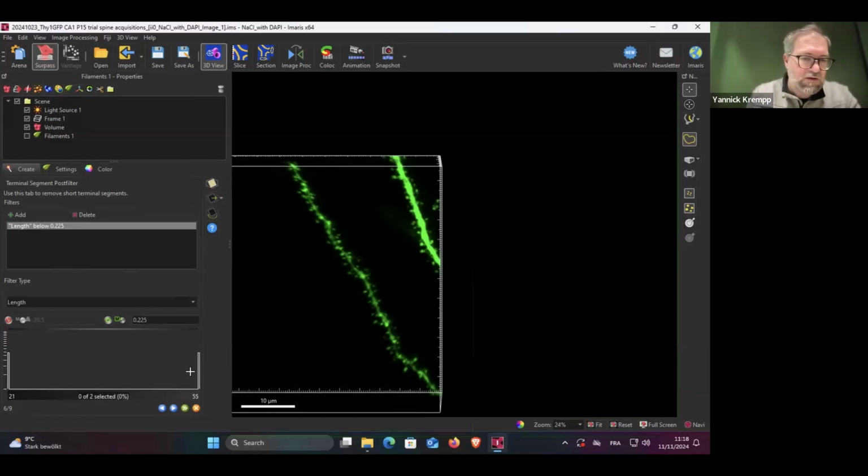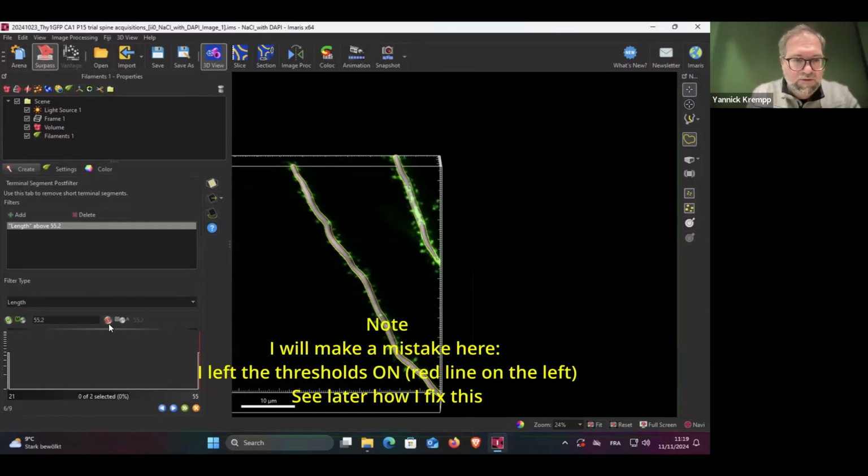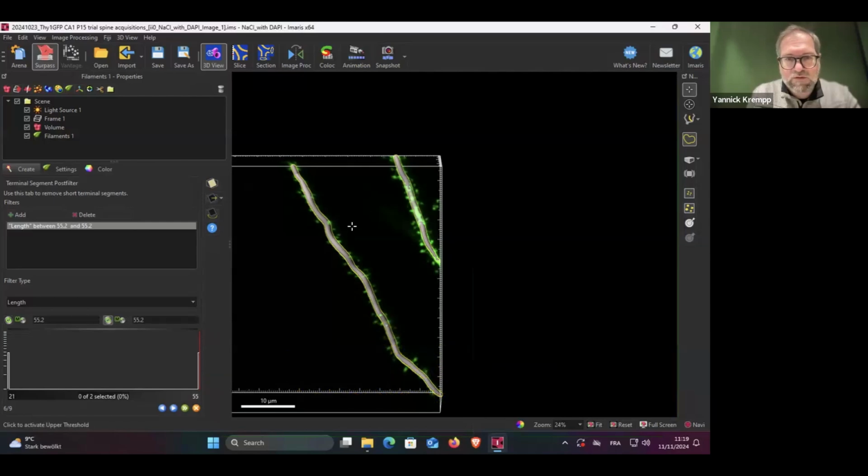So this is where this takes place. Here in this case, there is nothing to do. If you select filaments here, well, you will get into some trouble. So let's just leave it off. Yeah. So this is off. This is off. Okay. We need to keep everything.